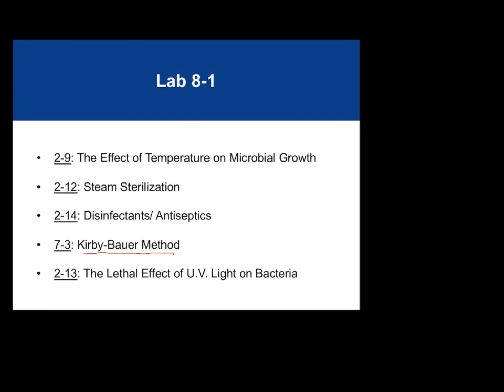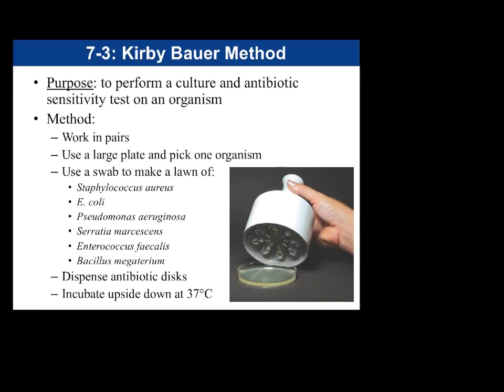For this lab, we're going to focus in on the Kirby Bauer method. The purpose of this test is to perform a culture and antibiotic sensitivity test for a particular organism.